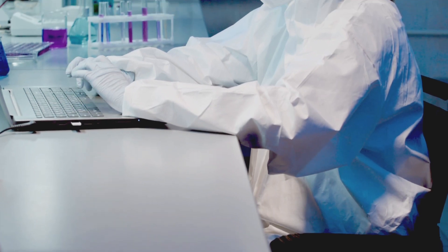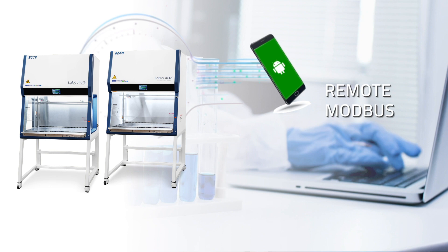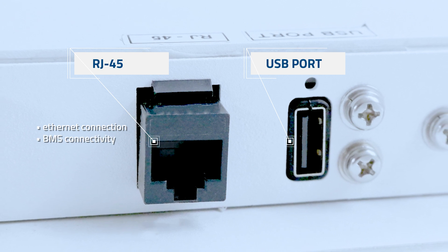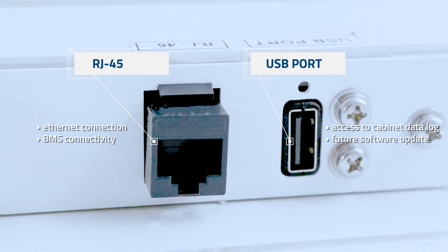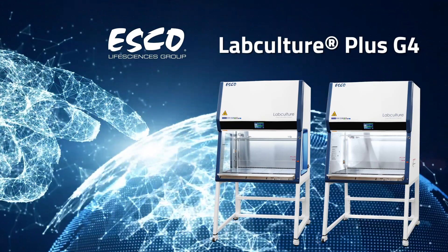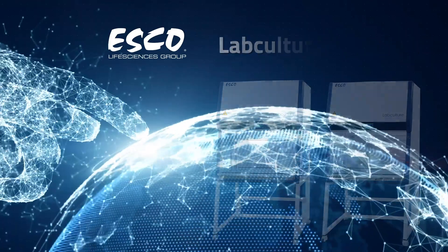Here's a bonus feature: the newly integrated remote MODBUS for secured wireless access between the cabinet and external devices. With an RJ45 port for Ethernet connection and BMS connectivity, and a USB port to access cabinet data log and future software updates. Unlock the future of safety and technology with the revolutionary ESCO LabCulture Plus Gen 4 Biosafety Cabinet.